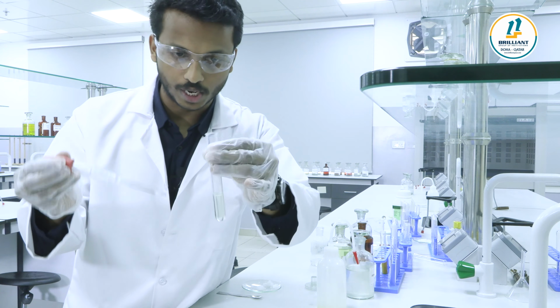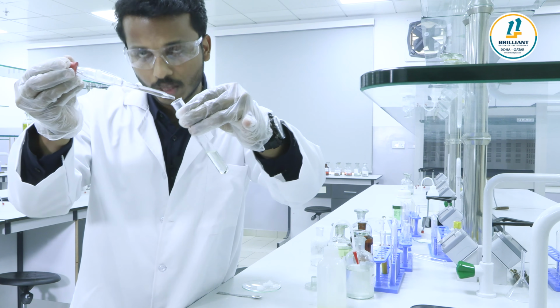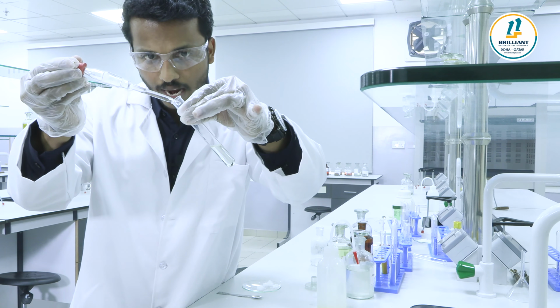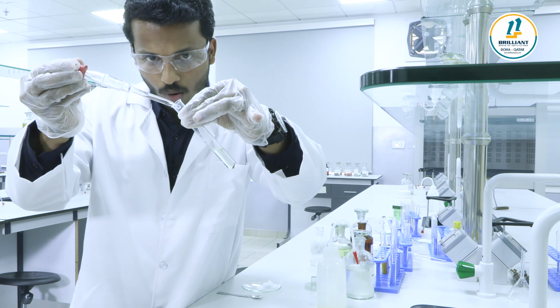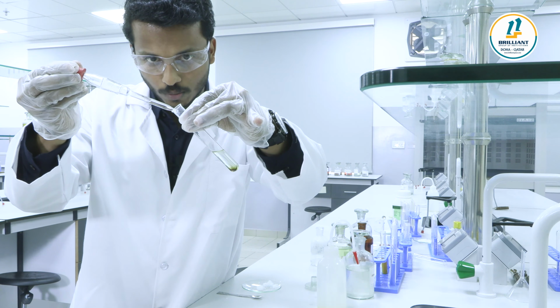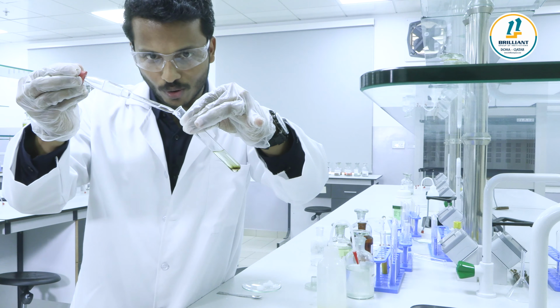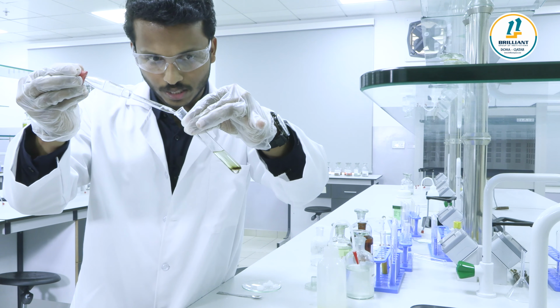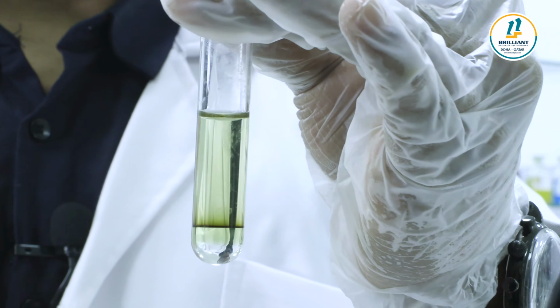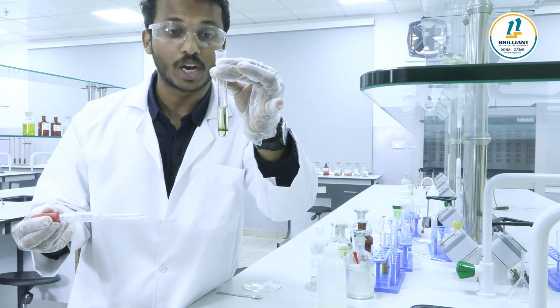Dear all, this is the solution. Hold the test tube at about 45 degrees, almost like this. Then add concentrated H2SO4 through the side of the test tube, drop by drop, without shaking it. Slowly add it. Now just hold the test tube like this. You can see that a brown ring forms at the junction of the two liquids.